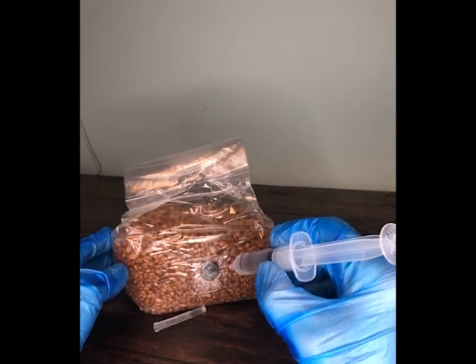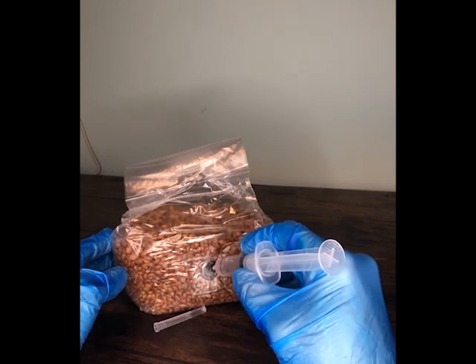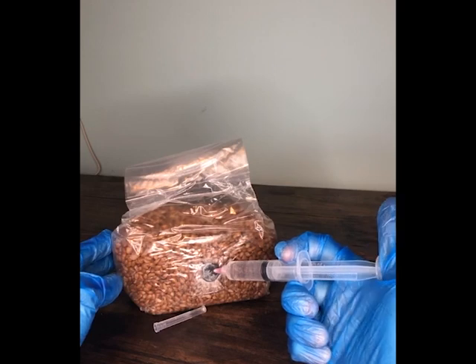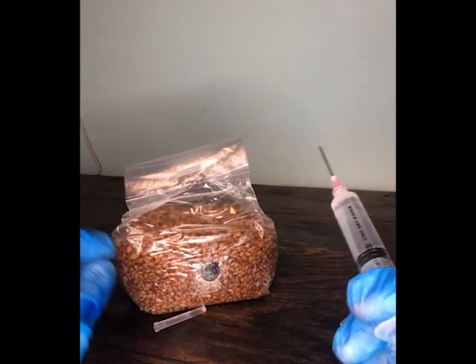Finally we're going to push the needle into the injection port on the bag and squeeze between one to two millilitres of liquid culture into the bag, and well done — you've inoculated your bag.